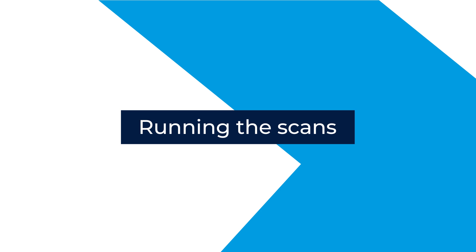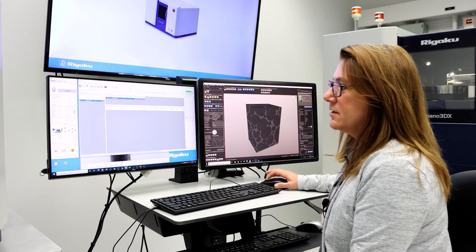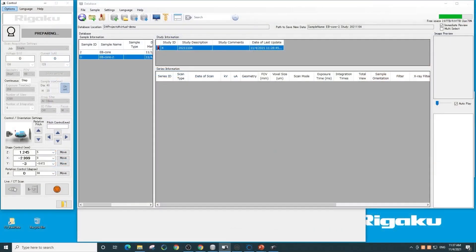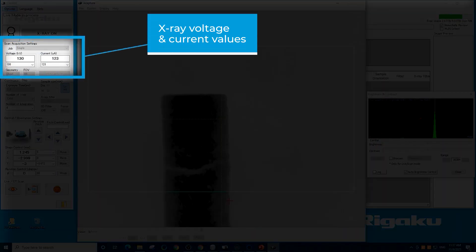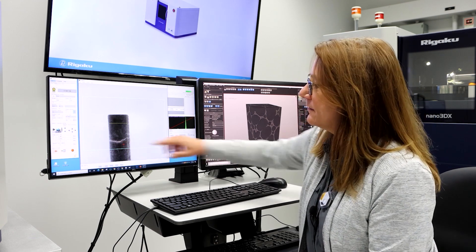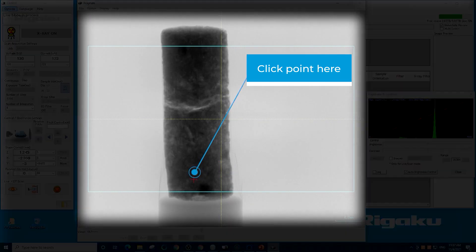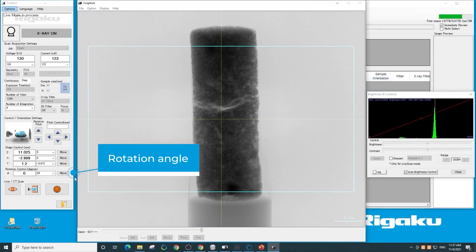We're going to come over to the instrument control software to collect our data. To set the scan conditions we'll use the software interface, but before we start a scan we have to center the sample. To do that, we turn x-rays on and then we see a 2D radiograph of the sample. We can actually see the crack in the middle of this sample, so we definitely want to investigate that. We center it just by clicking, and because our scan will be collected with 360-degree rotation, we'll want to center 90 degrees relative as well.